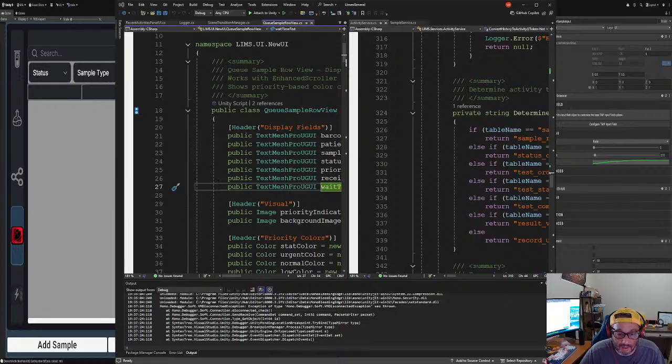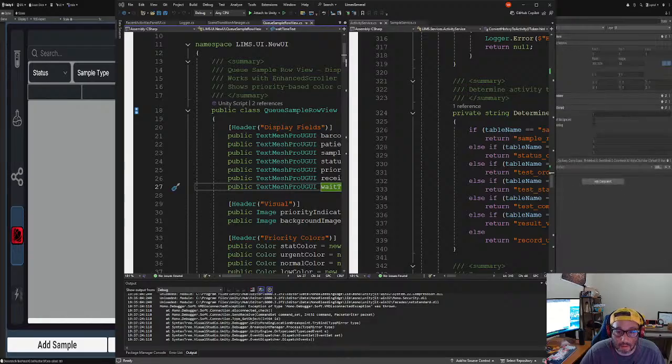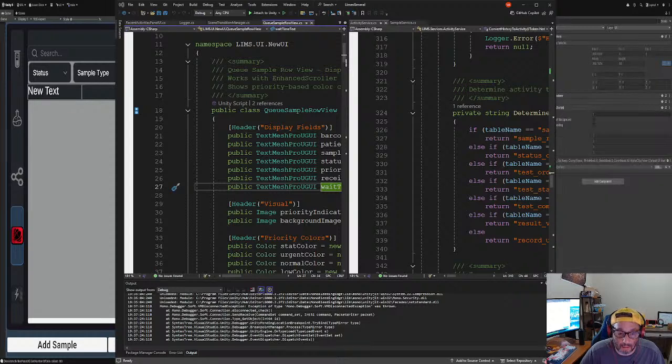All right, that's there. All right, but we're gonna undo that. Well, actually, no. Okay. Row cell. Right. Just do that.